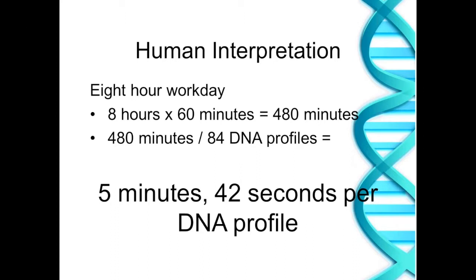I mean, if they're single source samples, yeah, of course you can do that. If they're 2-person mixtures, well, maybe, but you might be pushing it. It depends on how complex they are. Are they roughly equal in weights? Is there possible degradation or some dropout? As your complexity increases, your ability to interpret all of this in that span of time decreases. And if you start throwing in 3 contributor mixtures or even more, no, I would say it is highly unlikely that a human can interpret a whole plate in one workday.